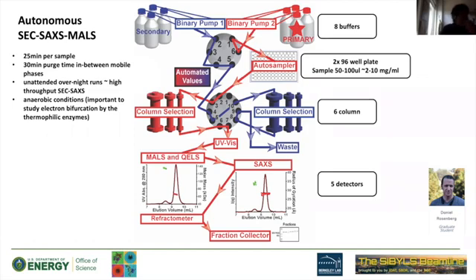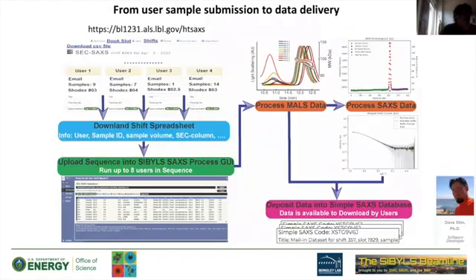And when you add some information about the phase or symmetry that you're expecting, you can add that into the calculation and deliver it to your higher symmetry models. Well, this is how the flow goes.